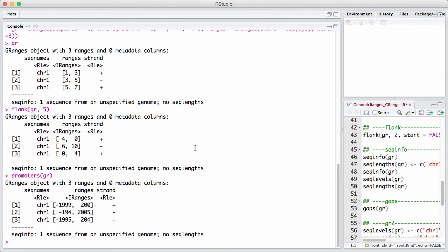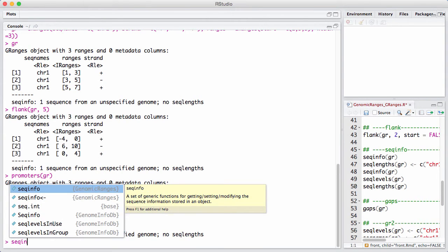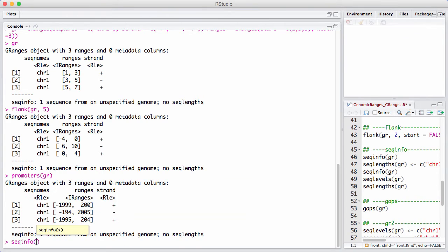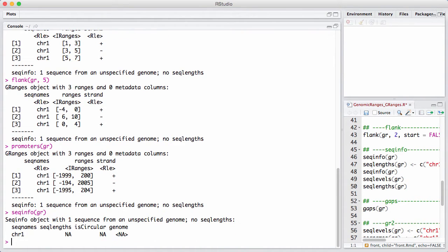A GRanges, since it has chromosomes, operates within a universe that is given by something called SeqInfo or SequenceInfo. Right now, we haven't given it a lot of information. It knows that there's a chromosome 1. It doesn't know how long it is, whether it's circular, or what genome it is.